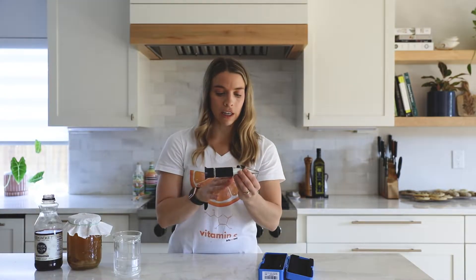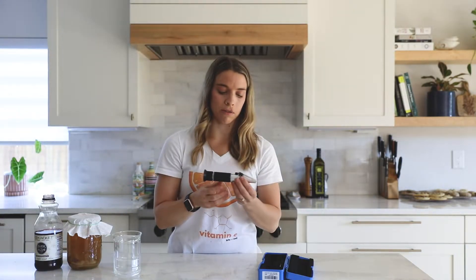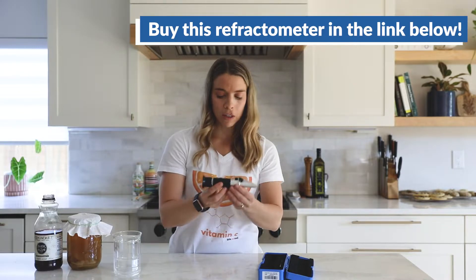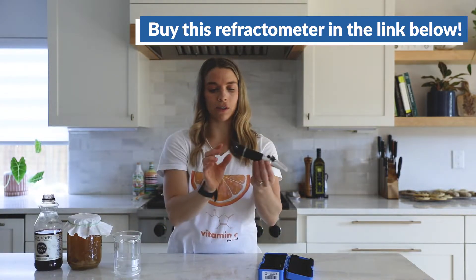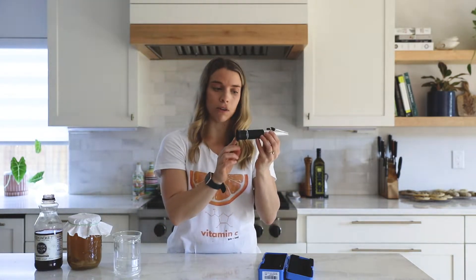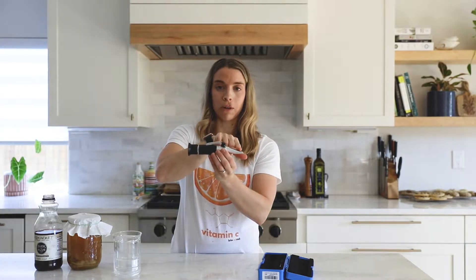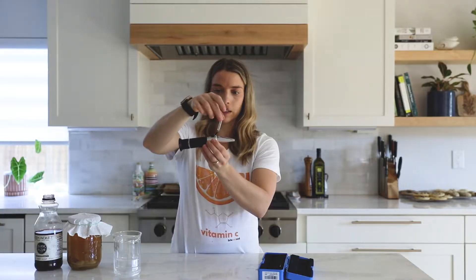We got this on Amazon for $20. They do have a range — you can buy a refractometer for around $100 — but we found this $20 one was great, so we highly recommend it. You'll see it has a couple different pieces: this is the eyepiece that you'll look through, here is a prism inside, this is where you'll put the liquid, and this is just a cap.